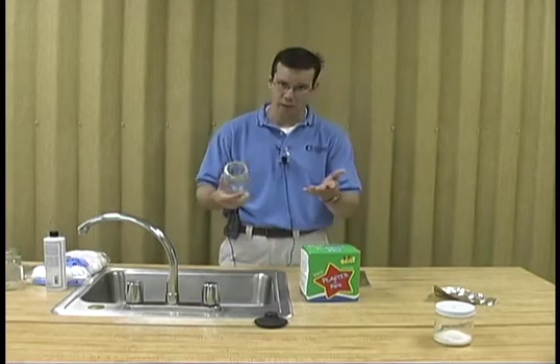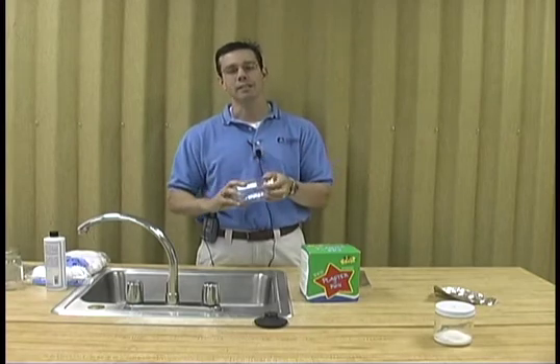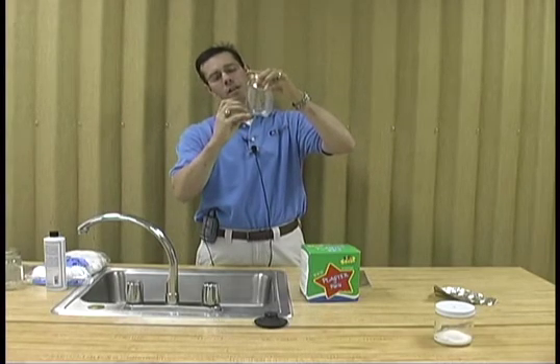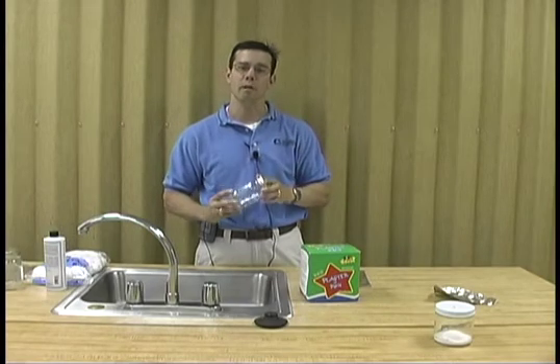So you mix your Plaster of Paris and pour it into the kill jar. You allow it to sit for about 24 hours. You'll put about an inch of Plaster of Paris in the container, let it sit for 24 hours, and it will harden.